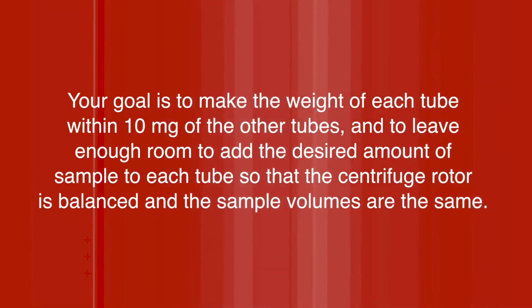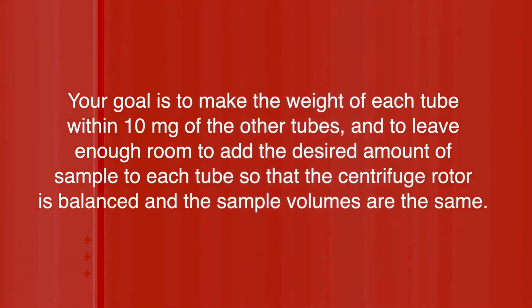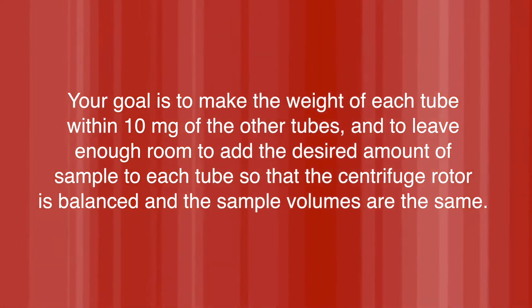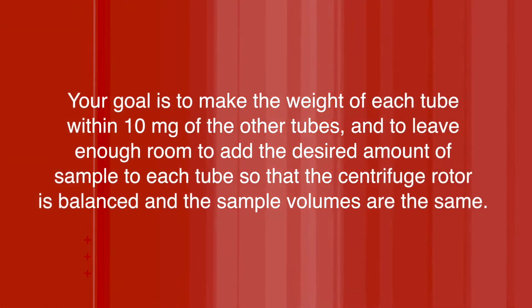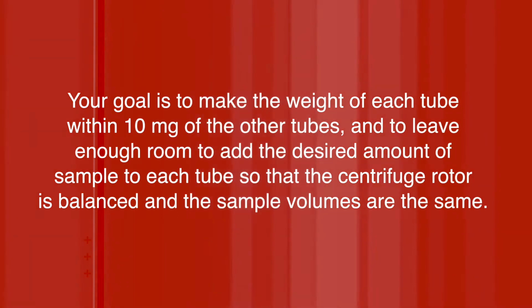Your goal is to make the weight of each tube within 10 milligrams of the other tubes, and to leave enough room to add the desired amount of sample to each tube so that the centrifuge rotor is balanced and the sample volumes are the same.